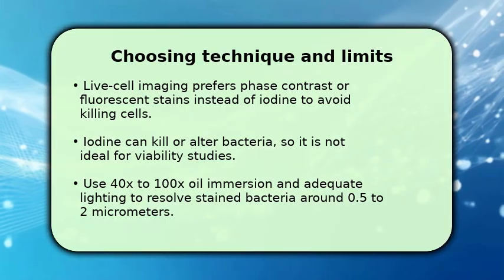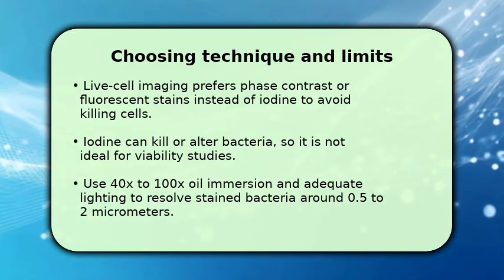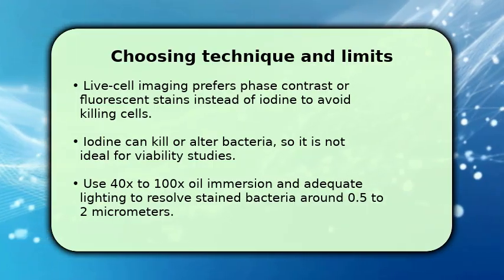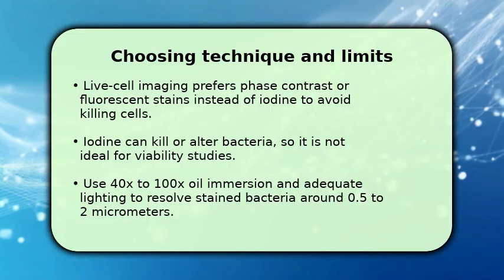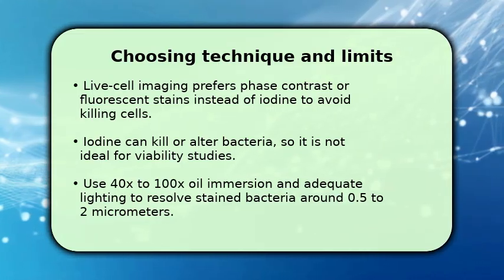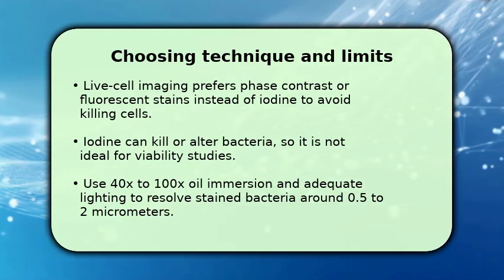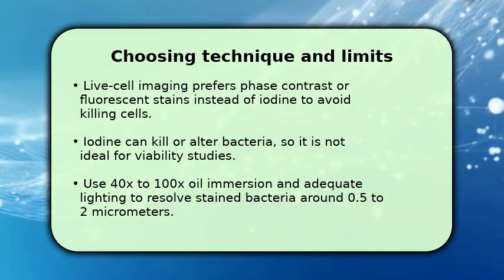or rapid identification. For routine observation of bacteria stained with iodine, use 40x to 100x oil immersion and adequate lighting to resolve stained bacteria around 0.5 to 2 micrometers, and always include controls to interpret staining artifacts.